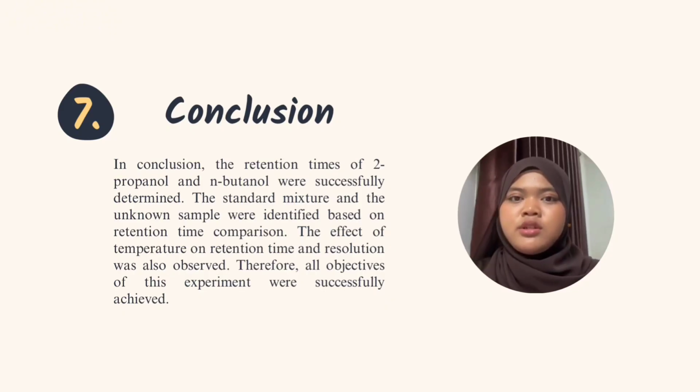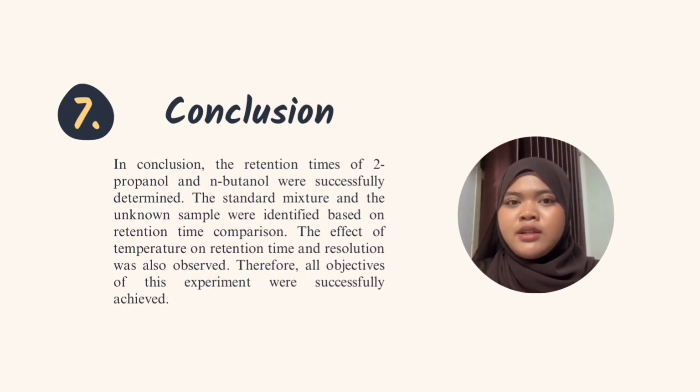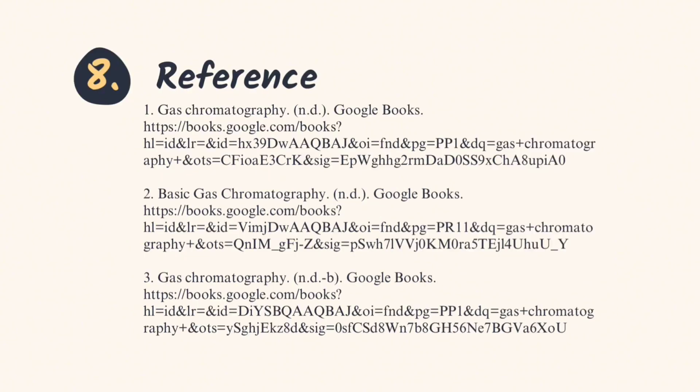In conclusion, the retention times of 2-propanol and N-butanol were successfully determined. The standard mixture and unknown sample were identified based on retention time comparison. The effects of temperature on retention time and resolution were also observed. Therefore, all objectives of the experiment were achieved.